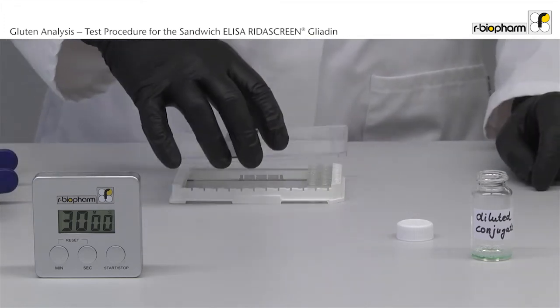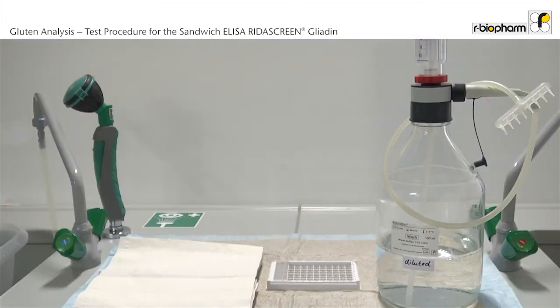Incubate for 30 minutes at room temperature. Put a lid on the plate. After the incubation the plate is washed 3 times.